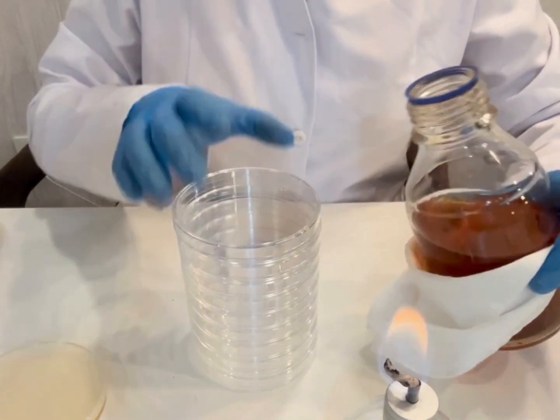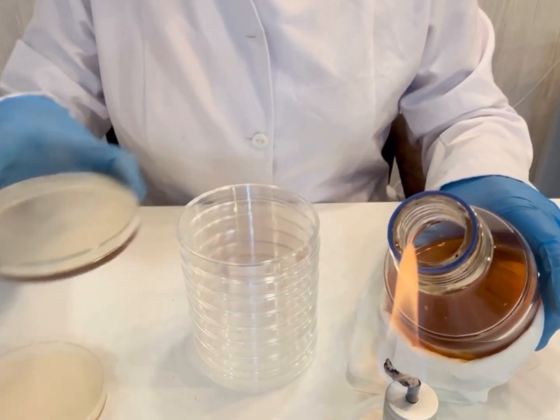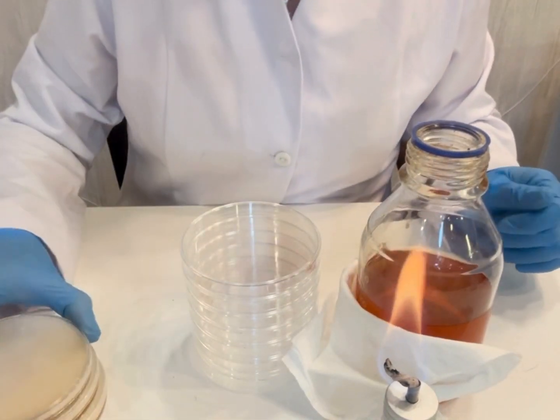It is also possible to preserve the medium intended to prepare solidified and sterile Petri dishes in tubes that will be melted in the Maria bath at the time of their preparation.